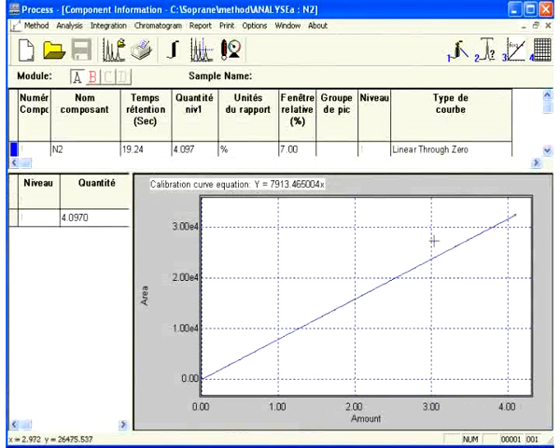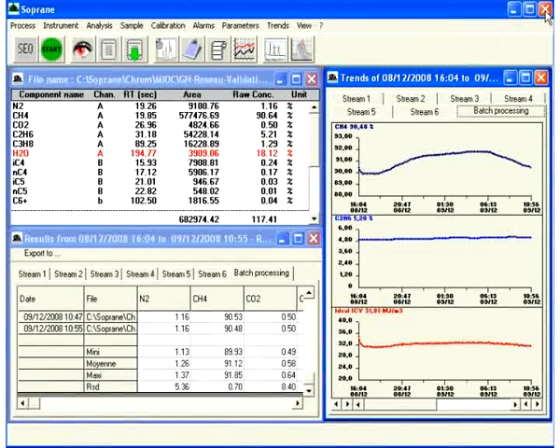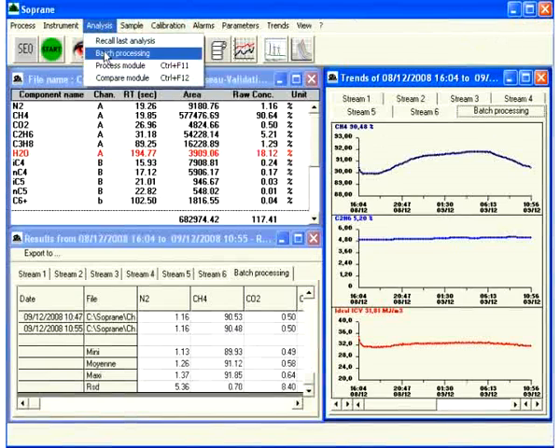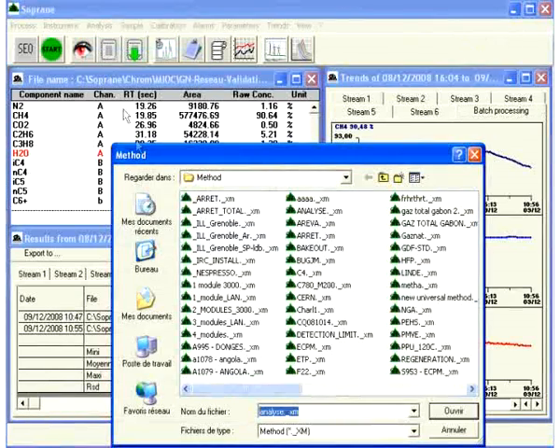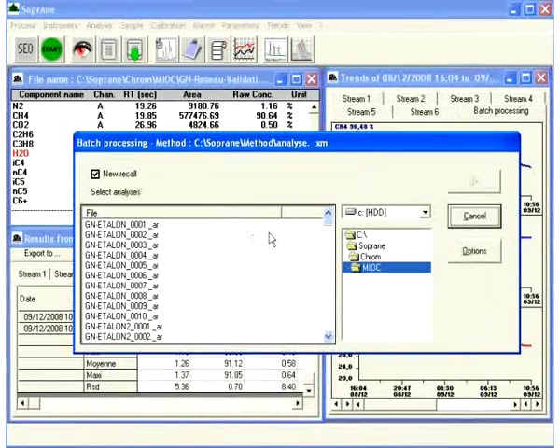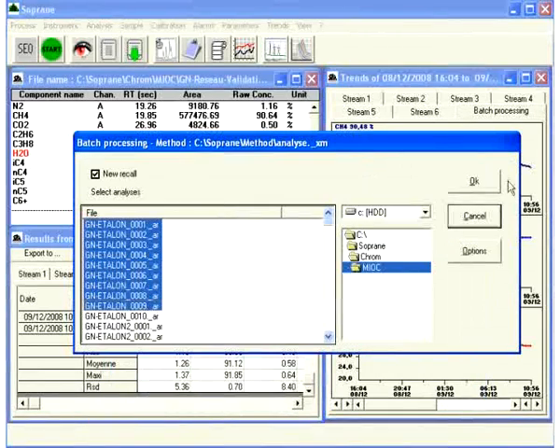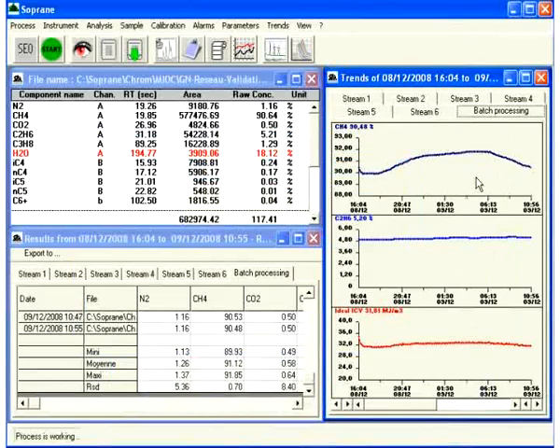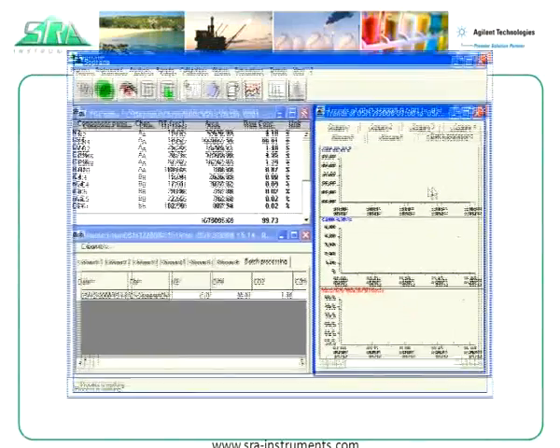This ensures that our engineers can identify any problem sources you might encounter and help you find the solutions at a distance. The resulting zip file can be sent via internet to SRA instruments so we can help you get your micro GC up and running quickly.